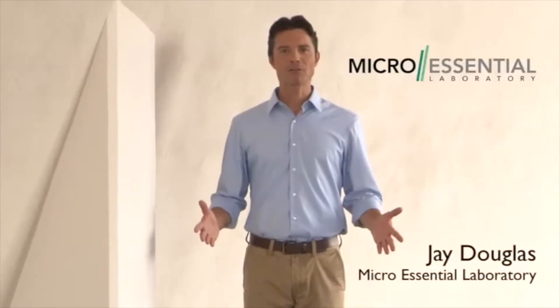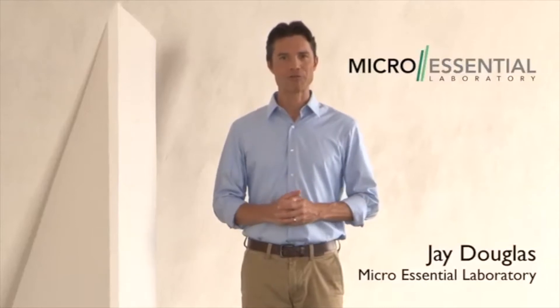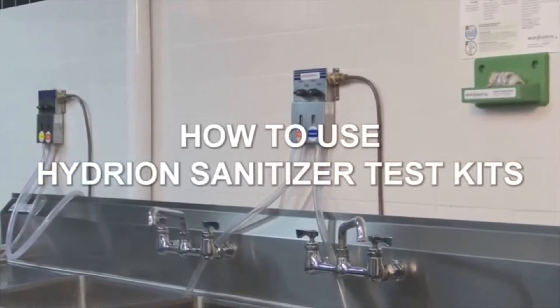Hello, I'm Jay Douglas with MicroEssential Laboratory, established in 1934. Now I will demonstrate how to use the Hydrian Sanitizer Test Kits.